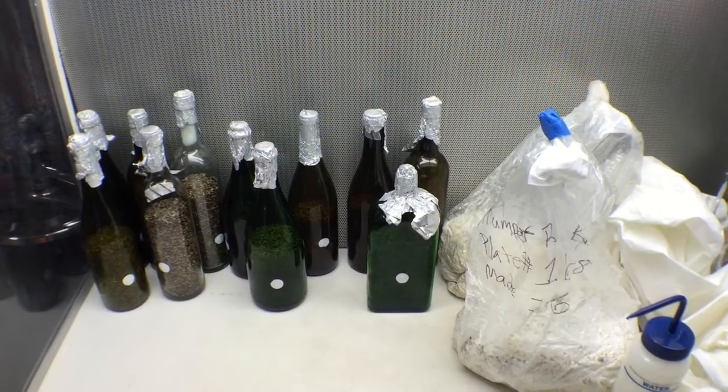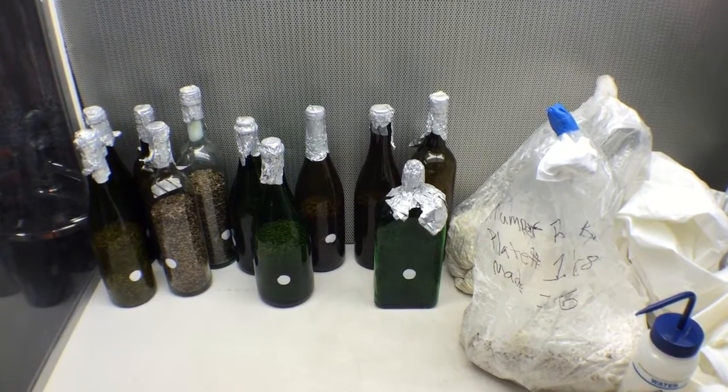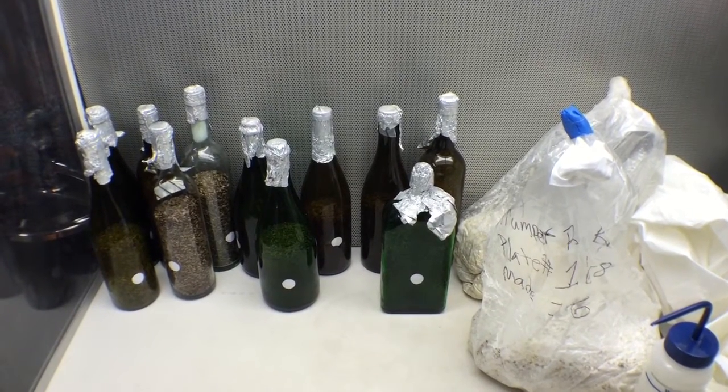This is Michael Lab Solutions and today we are going to do some grain spawn transfers into our wine bottle kits.